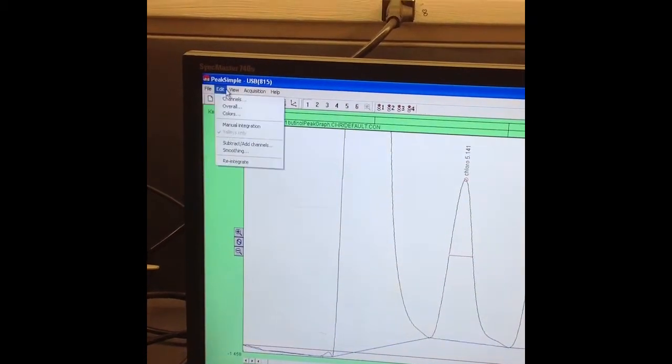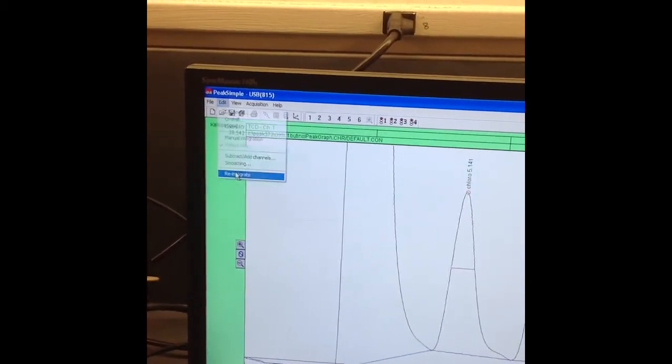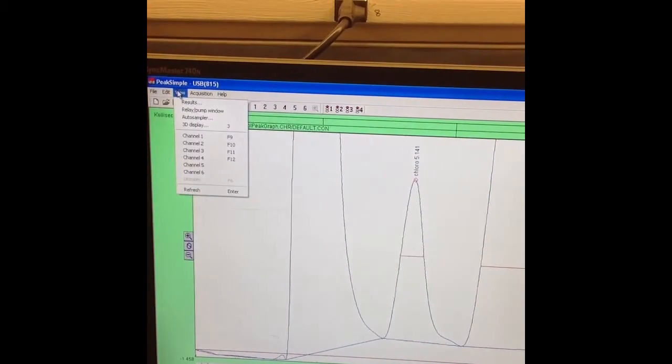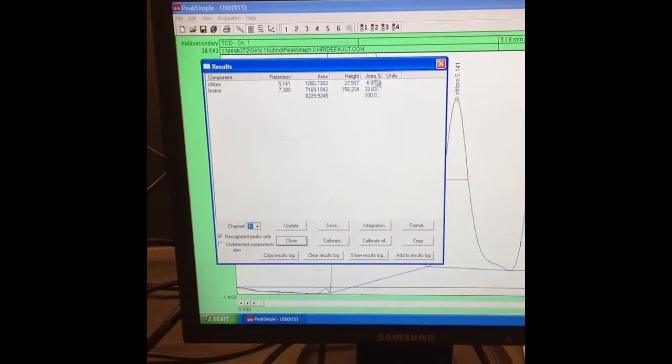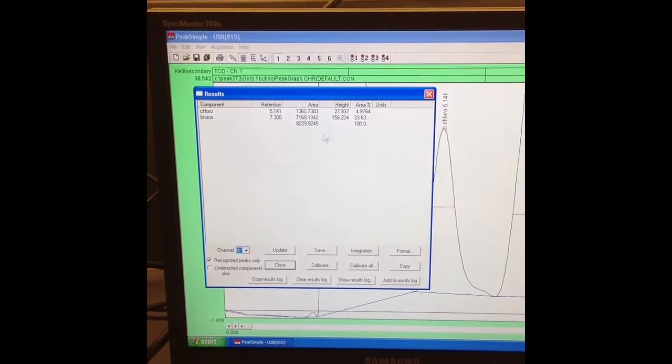So now once that is done, we can go to reintegrate and we can view results. And here we have our percent area, our height and area.